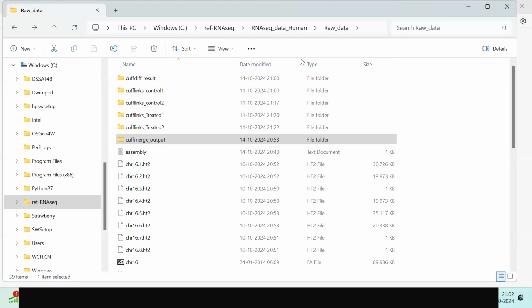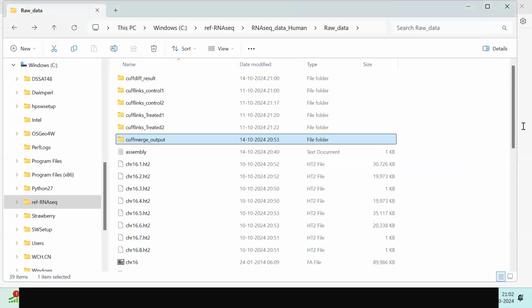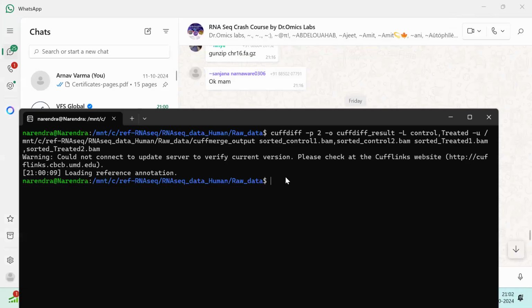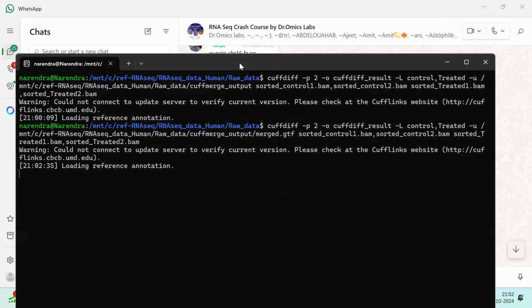Now run it. Okay. Done. Yes, it's coming.